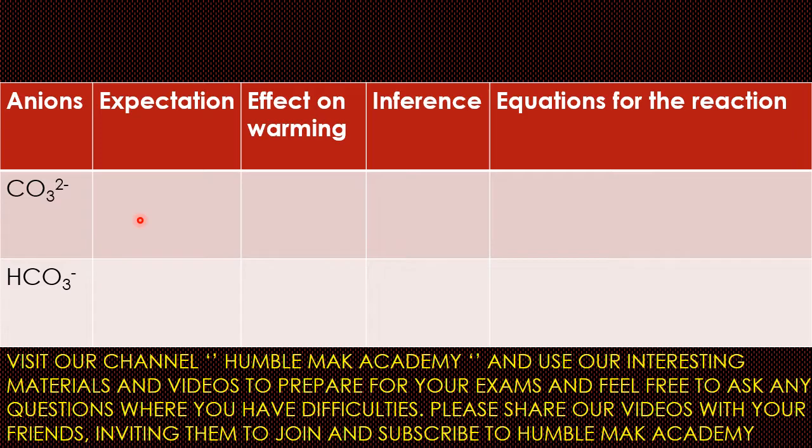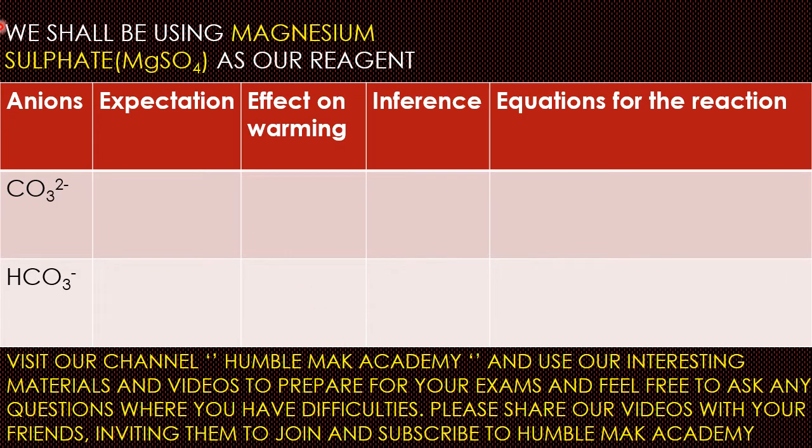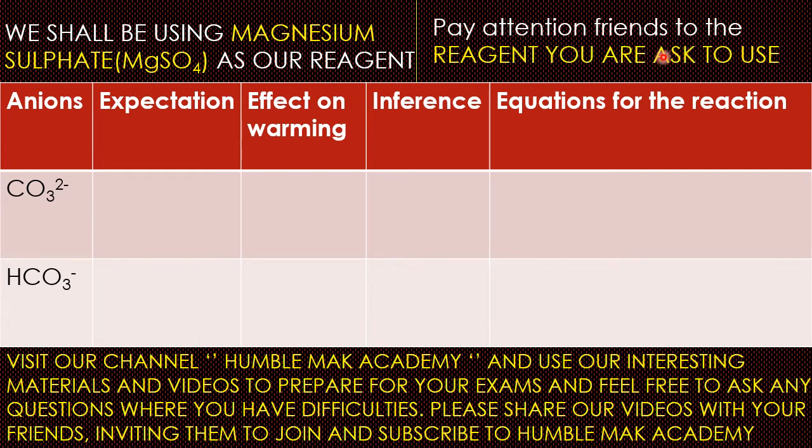Before we proceed, there's something I want to draw your attention to, guys. We shall be using magnesium sulfate in this case to get the presence of these two ions. Our reagent in this case is magnesium sulfate, that's MgSO4. Don't ever forget that you have to pay attention to the reagents. Pay attention to the reagent you're being asked to use, because different reagents are going to give similar results. What matters is the reagent you're using and your observations. Good. So guys, having that in mind, now let's dive straight into it.